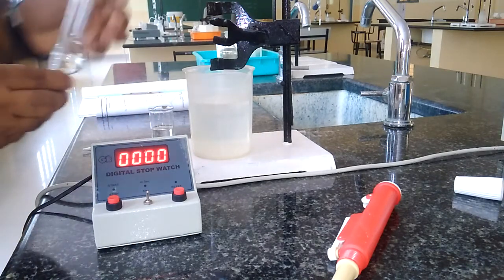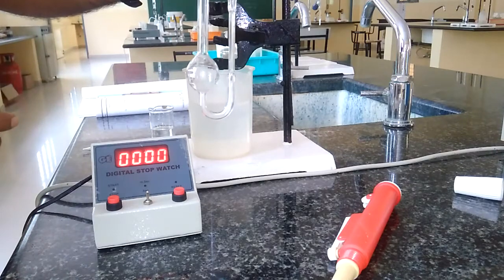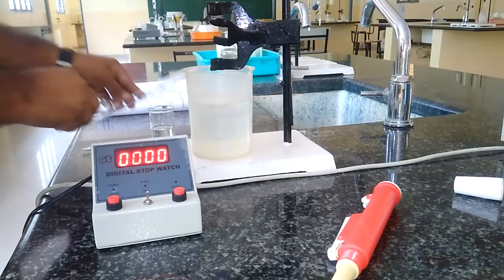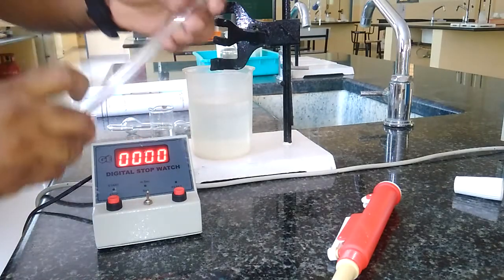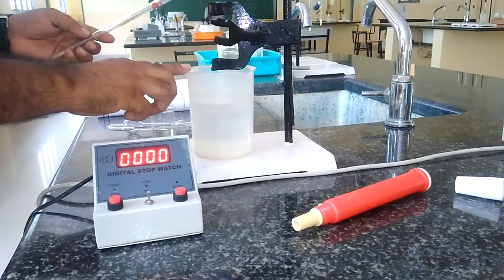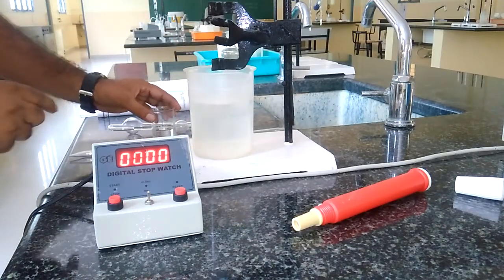The important components are: this is an Ostwald viscometer having two limbs, a big one and a narrow limb. This is a graduated pipette, this is a pipette head, and this is a beaker.